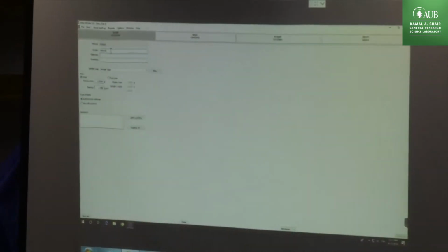You can replace your new sample with another sample done in a very similar way. For example, zeolite: next time, she will only have to change a small point at the beginning, but you can copy the same thing, so you don't have to enter all the data. But I want to show you how to enter the data. The first thing is the sample. You select the sample and you set the name of the sample, whatever you like.